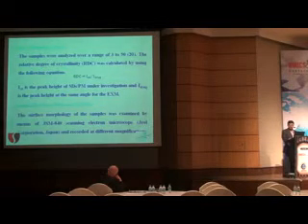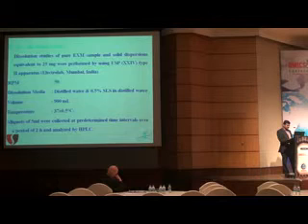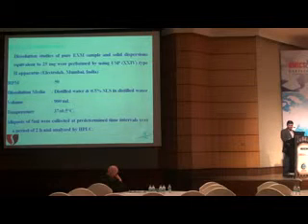And then XRD studies were conducted using an X-ray diffractometer over a range of 3 to 50 2-theta values, and the degree of crystallinity was obtained with a simple formula, intensity of SD by intensity of drug, where ISD is the peak height of the solid dispersions or physical mixture under investigation with respect to the pure drug peak, to understand the degree of crystallinity in the pure exemestane, followed by the solid dispersion and physical mixture.